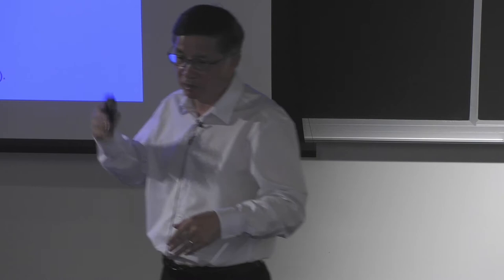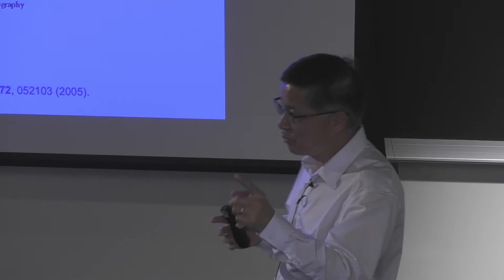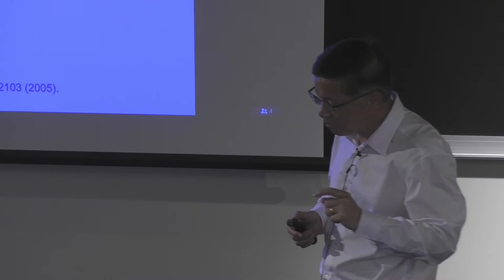He said, mathematicians actually showed there cannot be an exact polar fast Fourier transform. Actually, this has been shown in a mathematical book. But some mathematicians, Dave Donoho, some of you probably know, and collaborators developed the so-called pseudo-polar fast Fourier transform. So what is pseudo-polar?